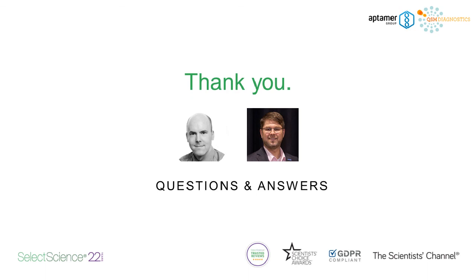Great, thank you, David. Next question is, is there any information on how aptamers perform in terms of sensitivity and specificity for small molecules and protein quantification when compared to LC-MS? So we haven't done any direct comparisons with LC-MS. Obviously, mass spec is a very sensitive technique, so the likelihood of an aptamer-based assay ever being as sensitive as something like mass spec is slim.